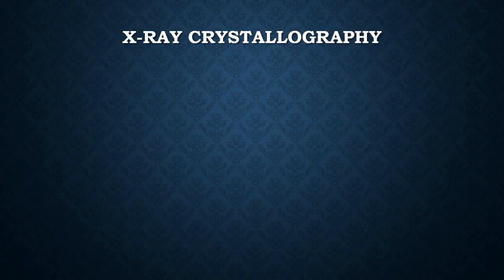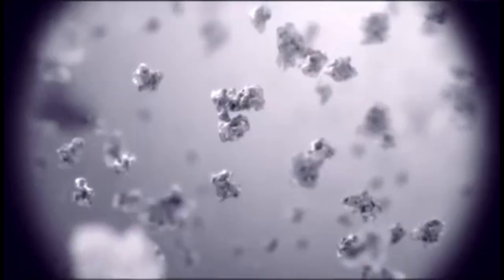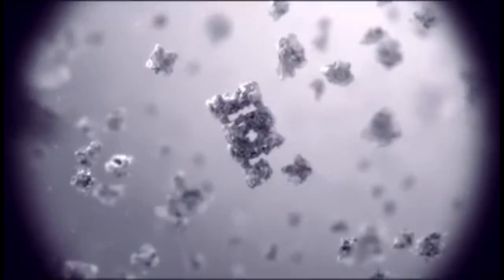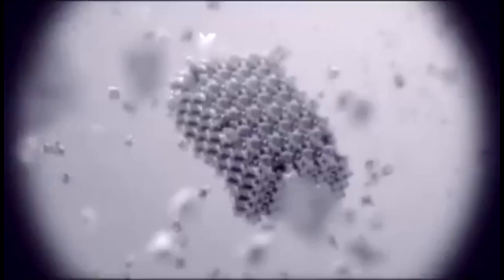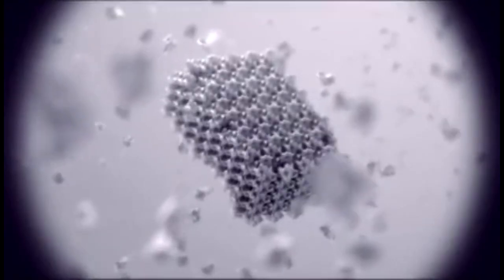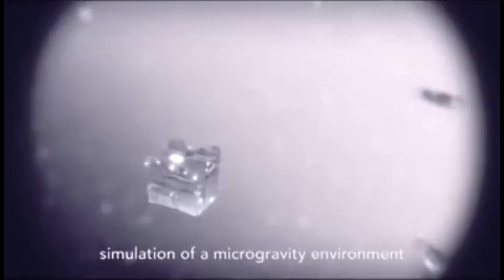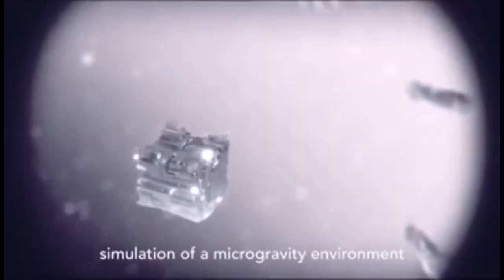X-ray crystallography is the most widely used method for determining the structure of proteins at the moment. The general process is to grow a three-dimensional crystalline structure of the protein, ensuring the crystal is as pure as possible. This crystal is then spun and targeted with an X-ray beam, whereby the electrons will cause the X-rays to bounce off them. This phenomenon is known as diffraction.